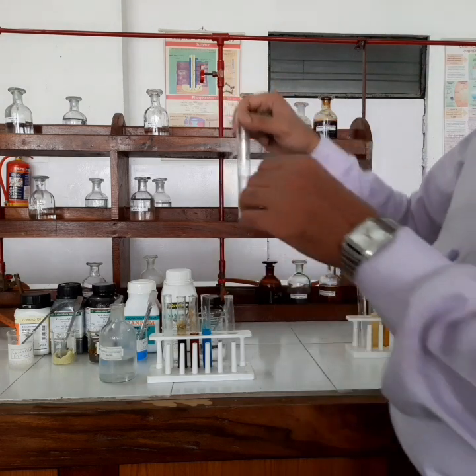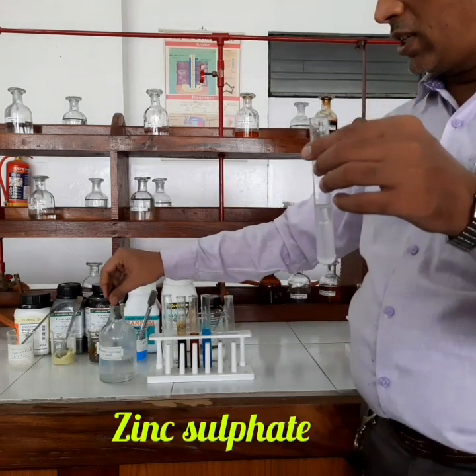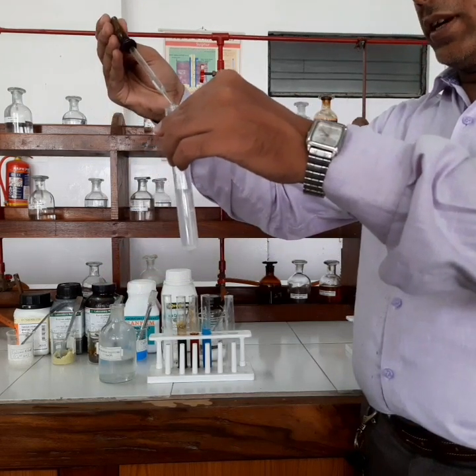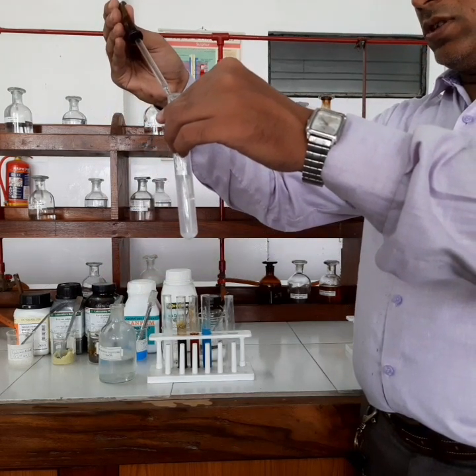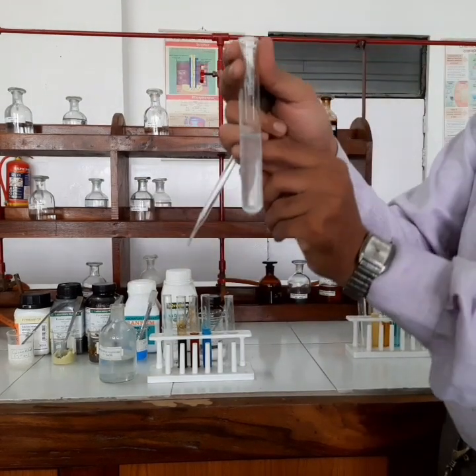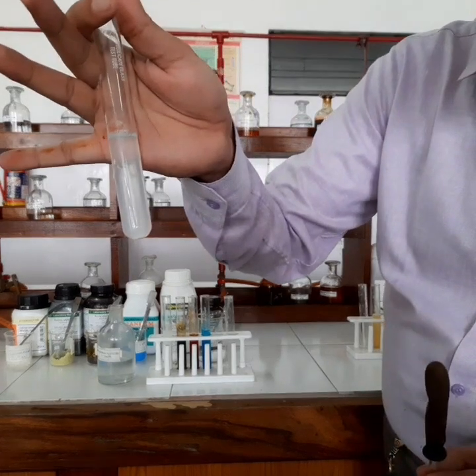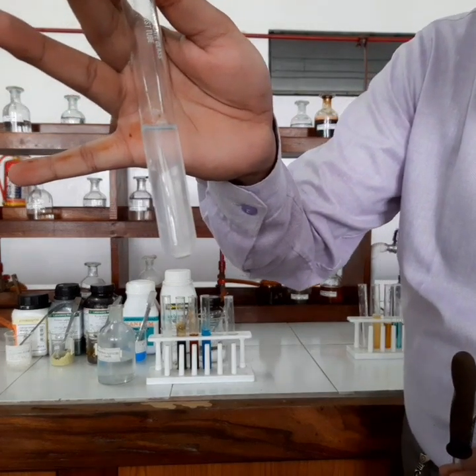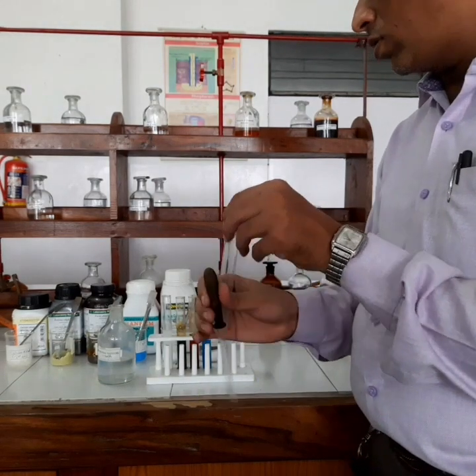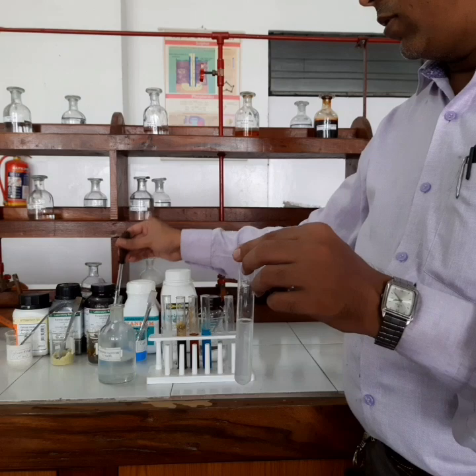Now this is the salt of zinc. I have taken zinc salt, and I am going to test for zinc ion. If you add NaOH in limited quantity, a gelatinous precipitate will be formed. Gelatinous means the precipitate will float, it will be gel-like. So as you can see, a gelatinous precipitate of zinc hydroxide is forming, and this gelatinous precipitate of zinc hydroxide will become soluble in excess of NaOH.